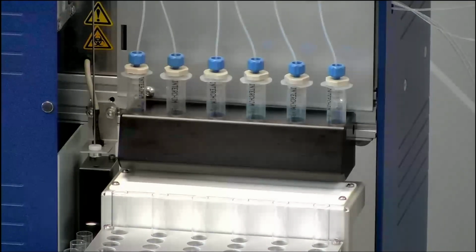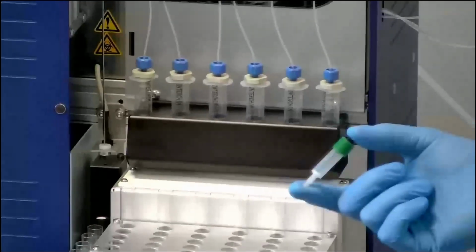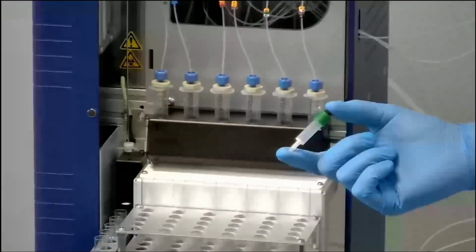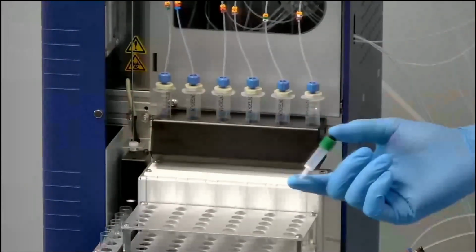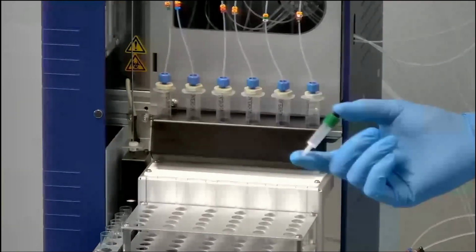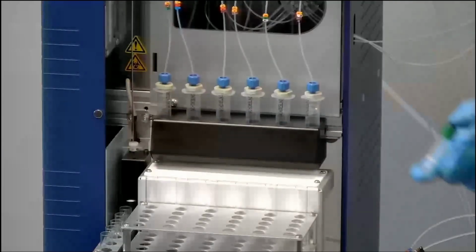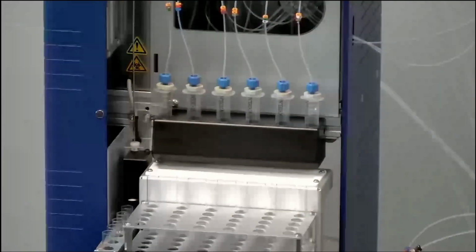That's why, for example, if you want to use this type of columns, it's not often silica. Sometimes you have a mix of different solvents and a specific sorbent, and you set a very low flow rate to avoid compacting your sorbent inside the columns.